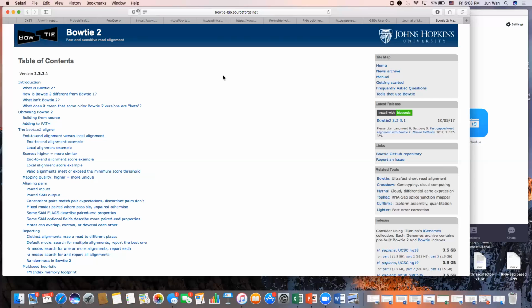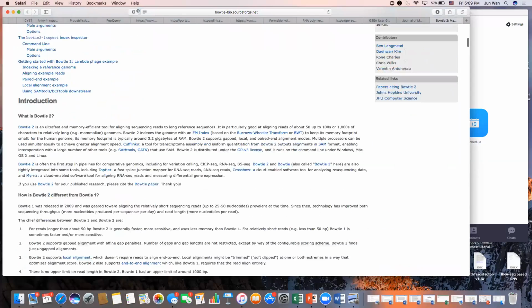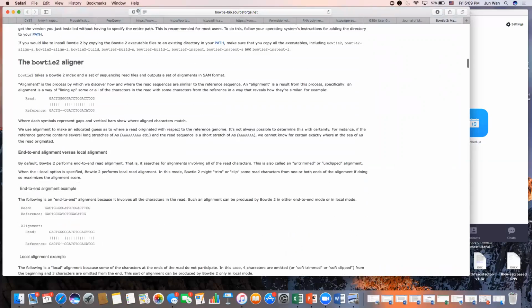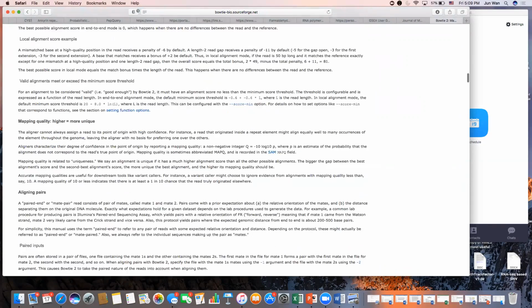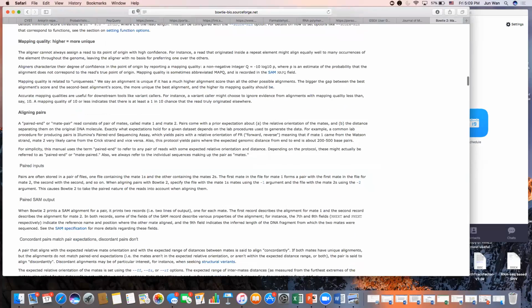One thing you're going to have to do, and you're going to see this, there's a command that we're going to use, and I want to come down to it because you'll see the differences in how this works. When you worked with BWA, you had to have that reference genome FA file. Do you remember that? You had the 2-bit file, you converted it to an FA.